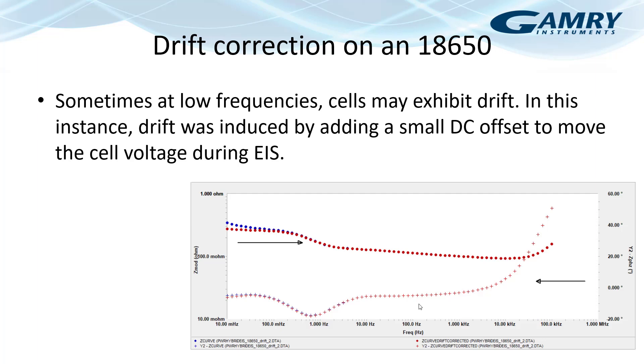What might this look like? Here we have an 18650 that we applied a small DC offset to move the cell voltage during this particular hybrid EIS measurement. And we can see at the higher frequencies, this small offset doesn't really change the cell voltage much because we don't see much in terms of the corrected and uncorrected data. So as we get to lower and lower frequencies, though, we can see that the cell actually was drifting because of this DC offset that we were applying, purposefully causing the drift. And so the red curve is actually the drift-corrected impedance plot. Again, that functionality is there. It's up to you to decide how you would like to use that.